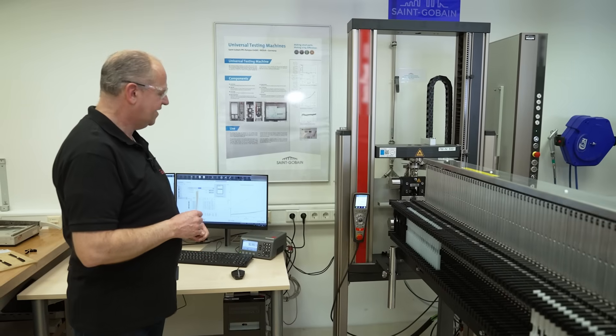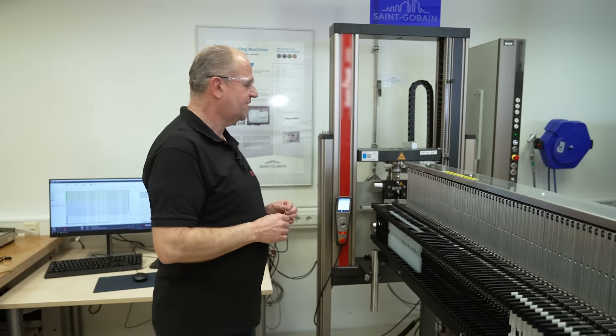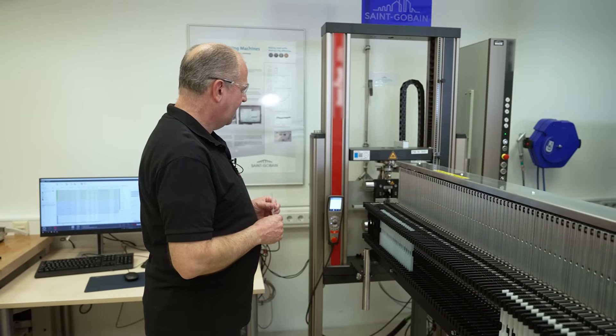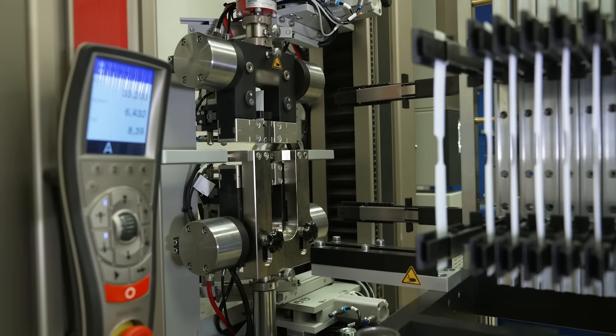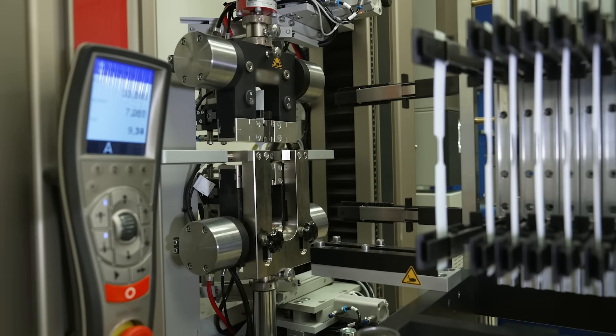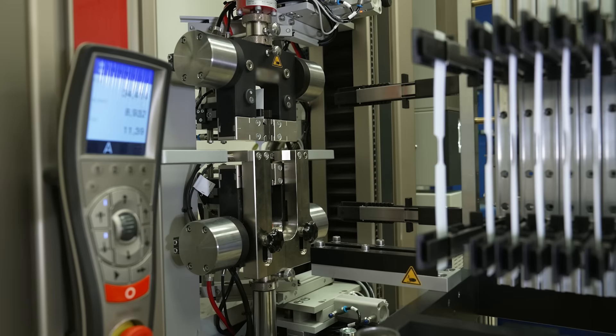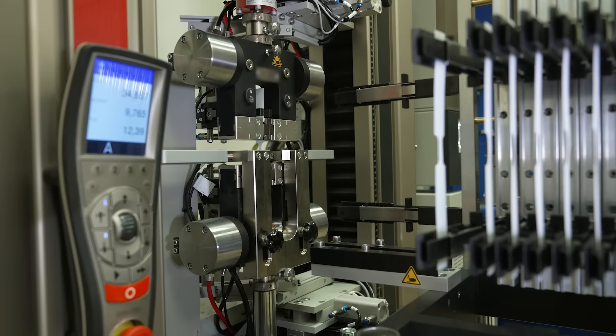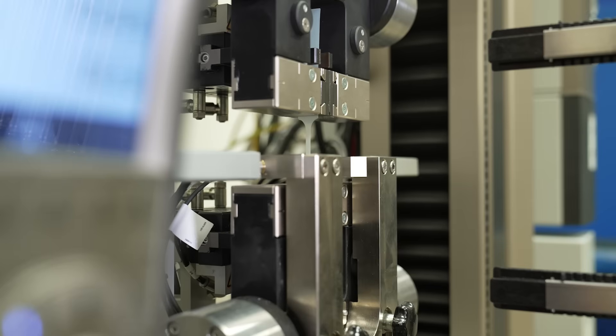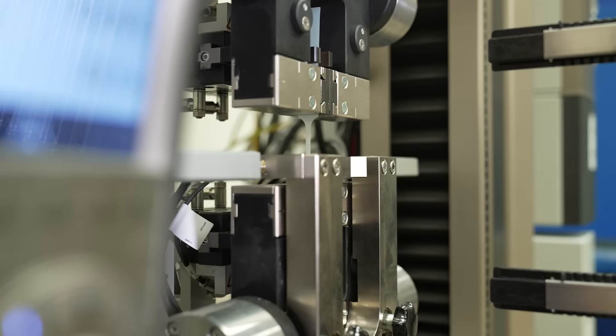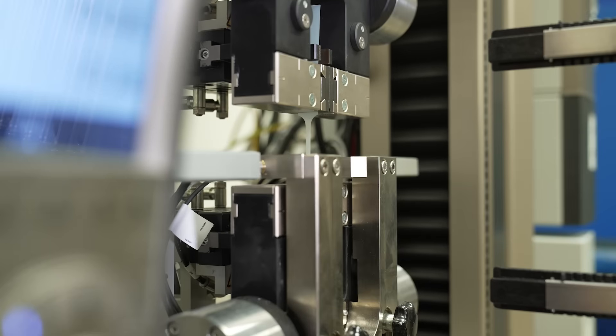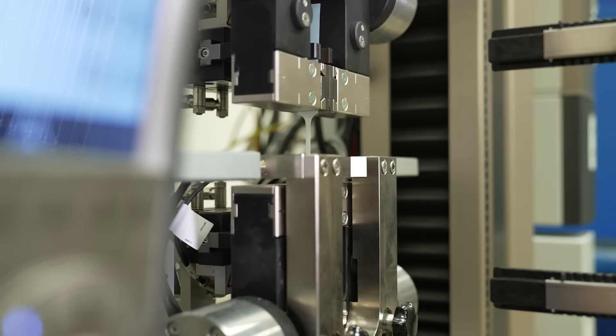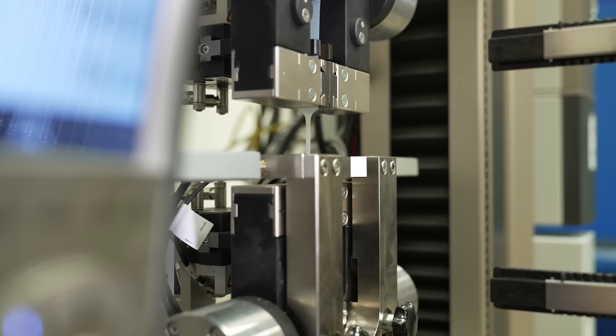It's directly recorded to the computer system, and now the tensile test is starting. Due to the fact that we have very soft material, it takes a while during the sample is breaking.